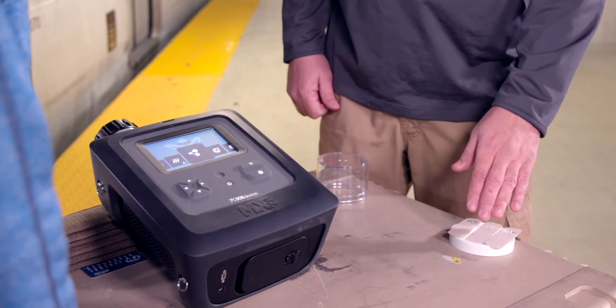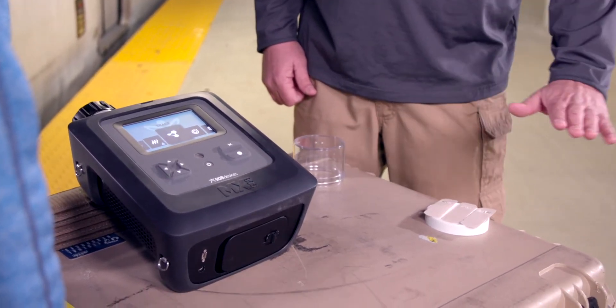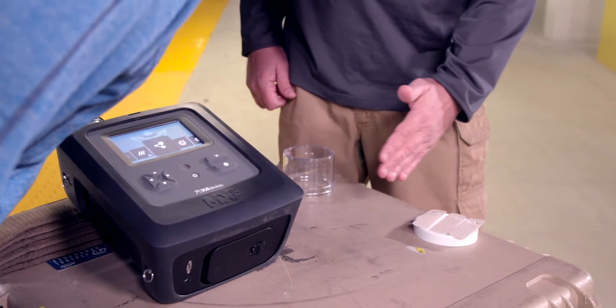This is the original swab. When you're going to run a trace sample like we're going to do now, you run a swab of the swab of the swab. You want to go from the highest concentration and then minimize and start with the lowest concentration first.